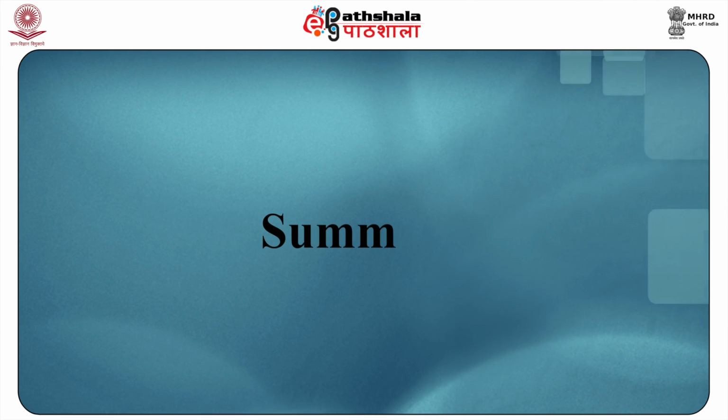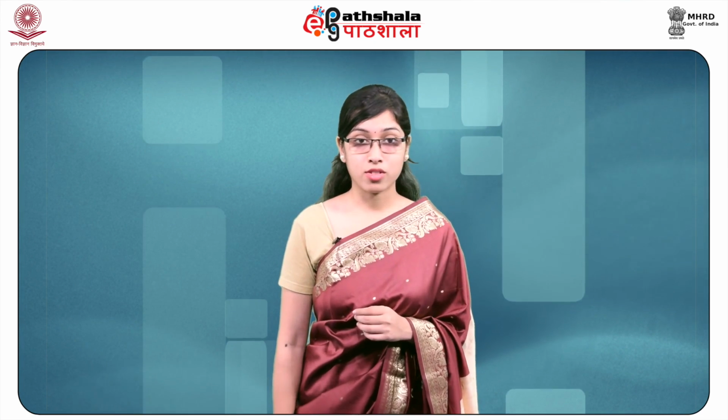Now, dear students, let us summarize this chapter. Electrophoresis is an electrokinetic phenomenon which is used as one of the major technologies currently available for molecular separation of charged biomolecules in the laboratory. The most commonly used form of electrophoresis is gel electrophoresis, where a gel-based matrix such as agarose or acrylamide is used for separation of molecules. Gels are used as a sieving medium during electrophoresis that retards the migration of charged molecules.